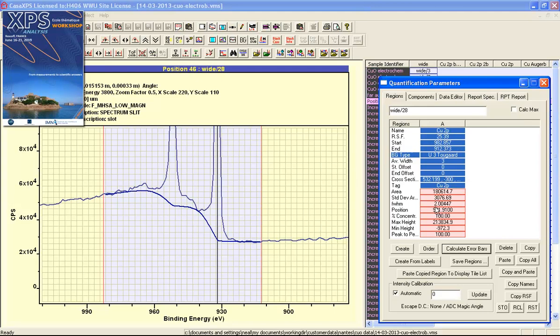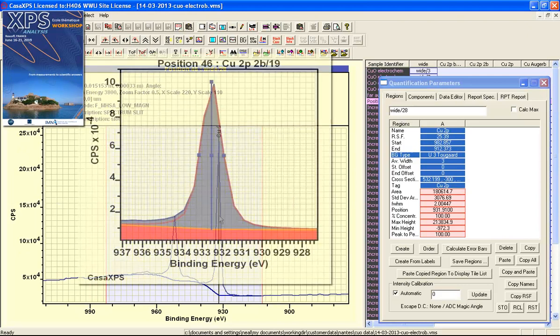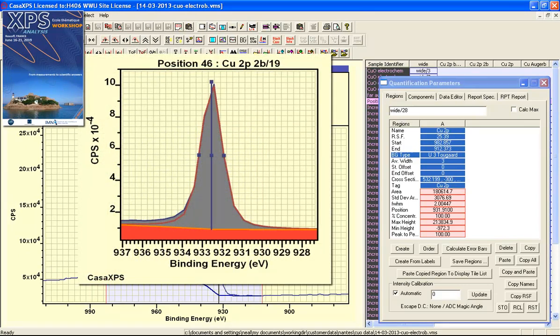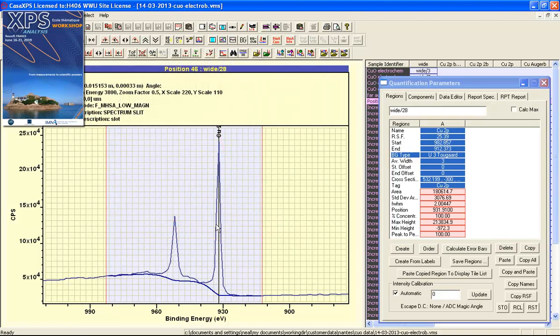The full width half maximum for the peaks are then calculated and reported. The full width half maximum corresponds to the maximum height, and then half that intensity—the width of the peak at half that intensity—gives us the full width half maximum.